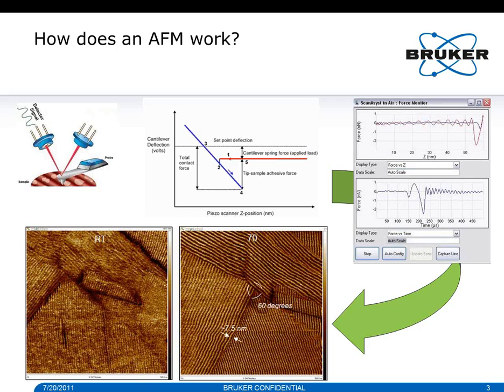The predominant mode in the past was tapping mode, but we found that mode, which we refer to as peak force tapping, a much more useful mode because it has a lot of advantages that allow us to extract, in addition to topographic, also a lot of quantitative information out of the surface. To make it short, at the end, you get quite high resolution images with an AFM.